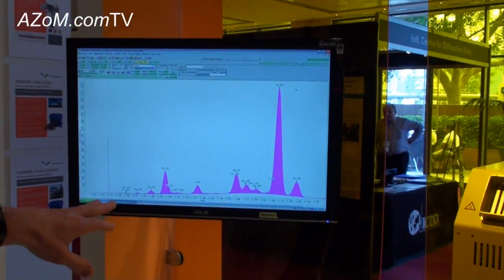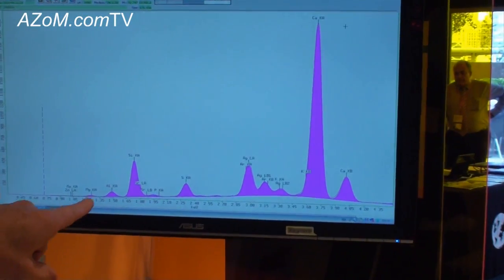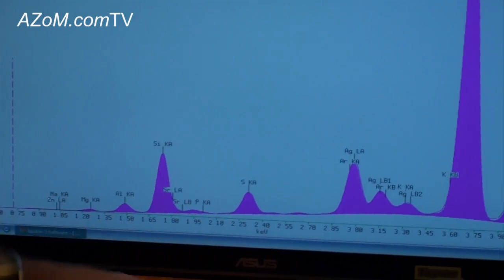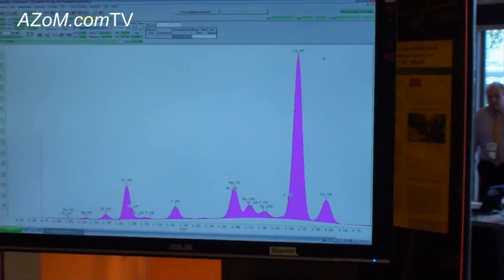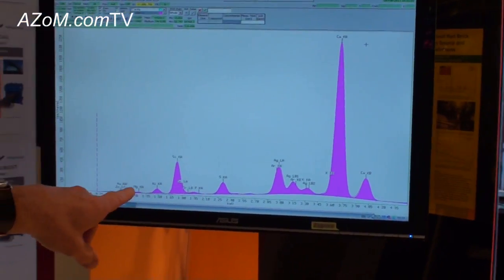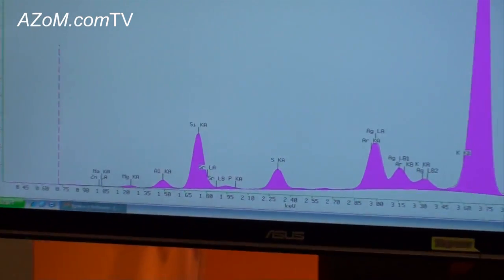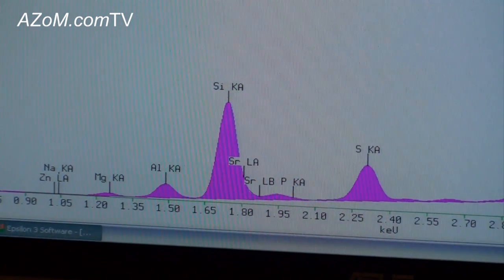On this screen here, you can see the spectrum of the cement bead. You can see here the typical components: aluminium, silica, sulphur, and of course the calcium peak from cement. One of the points to note here is the excellent resolution and symmetry of the peaks, which makes the data reduction a very simple process.